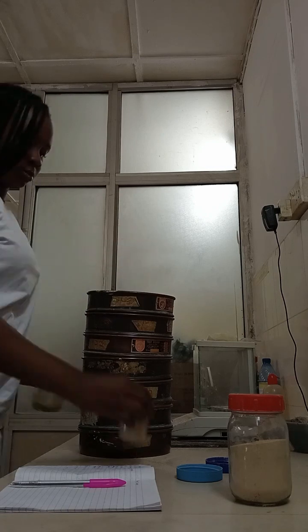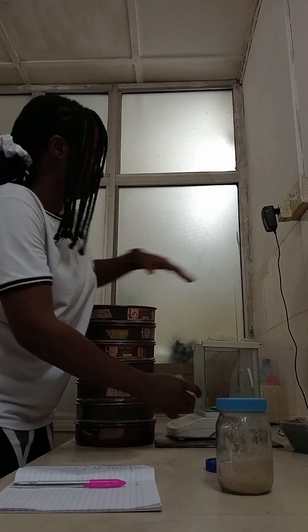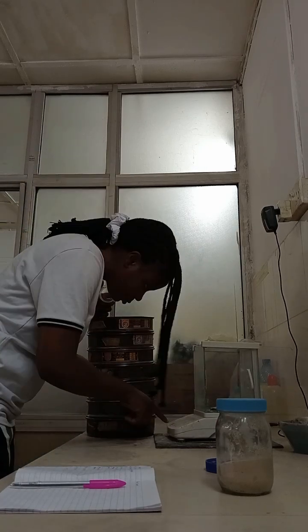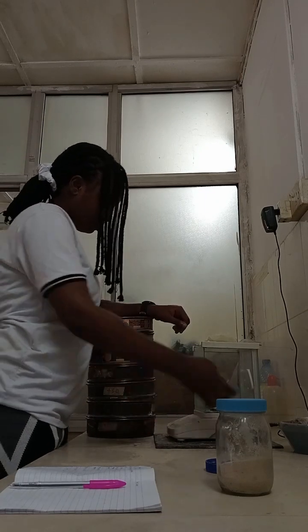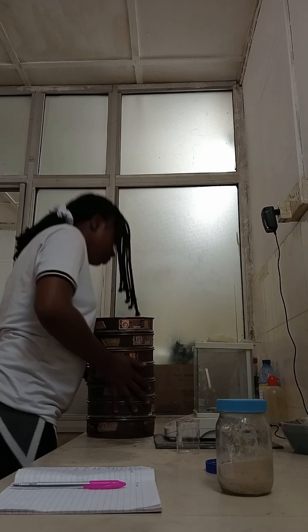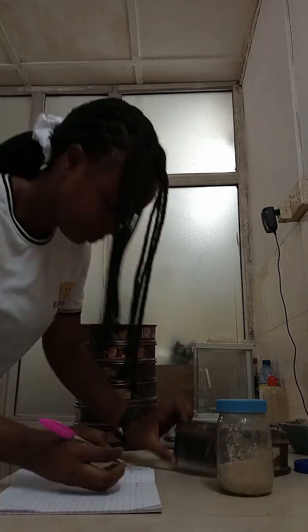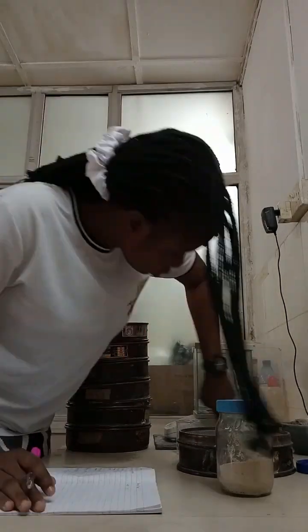This sample in my hand is the silica, that's the sand. Chemically, it is called silica. In this sieve test, you measure the grains and all that. There's a specification, so once this particular sample passes that specification, then we can accept it from whatever company is supplying it to us. So I have to record it, you sieve everything.